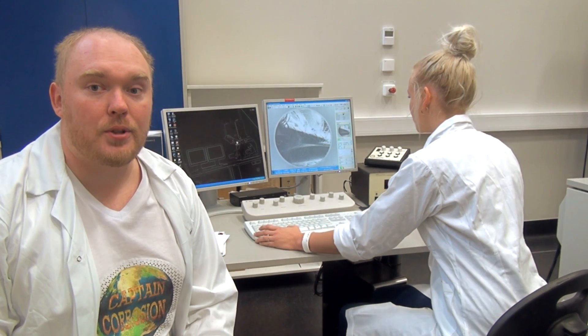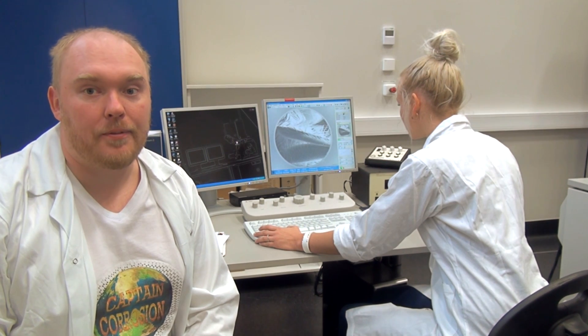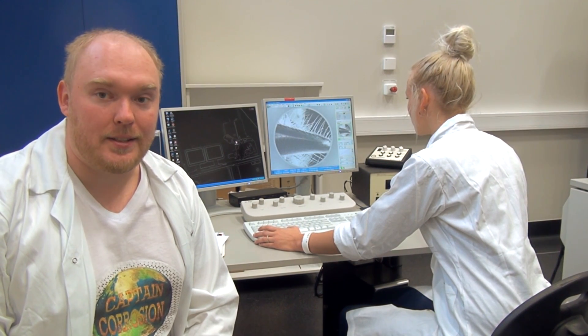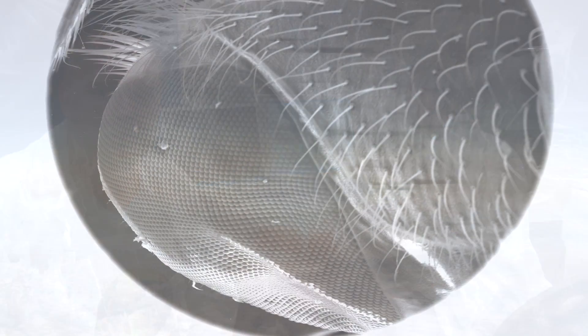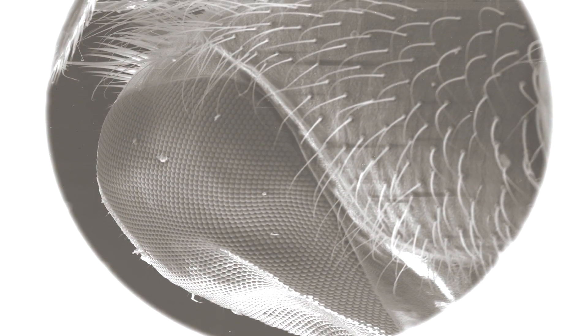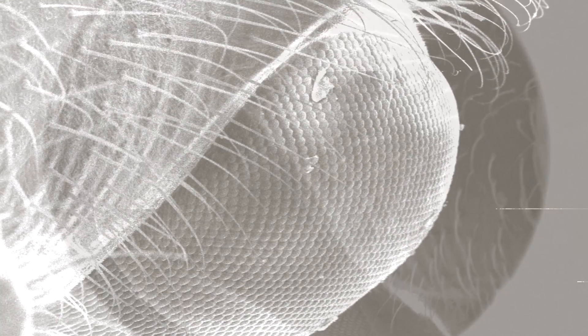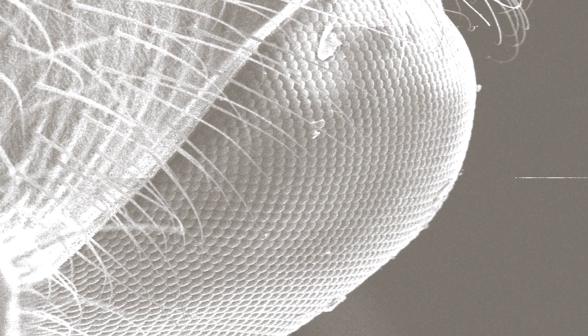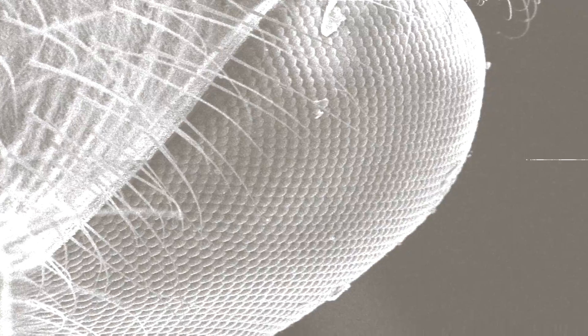The next stop is the eye of the fly — one of the thousands, that is. Flies have a pair of large compound eyes on the sides of the head. Compound eyes consist of many photoreceptor units, thus providing a wide-angle view.